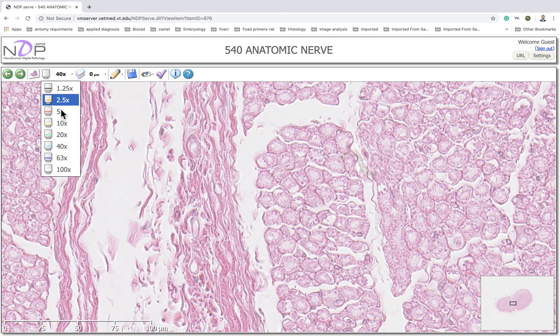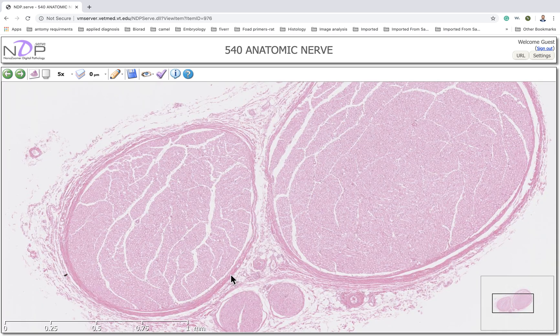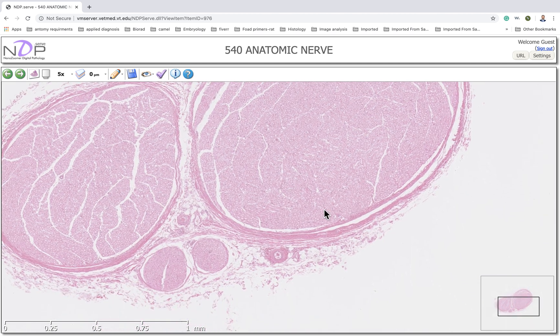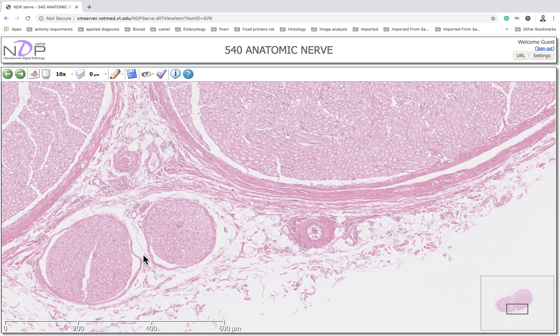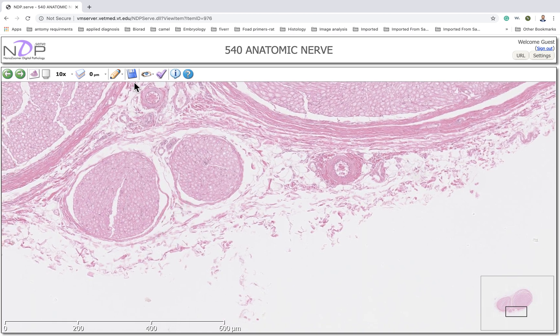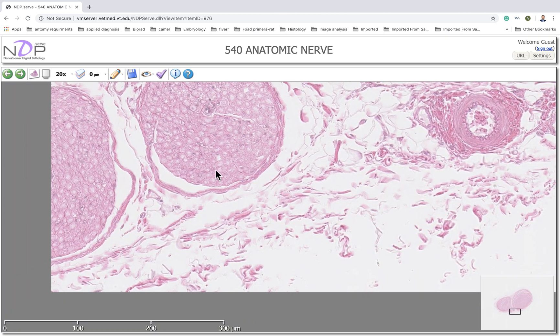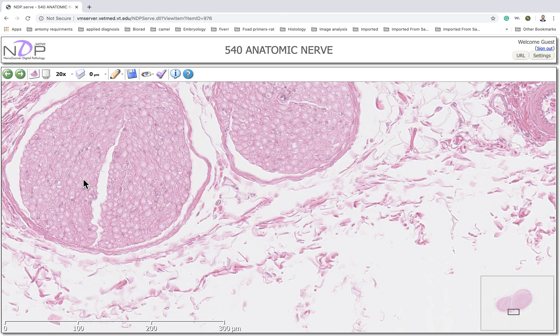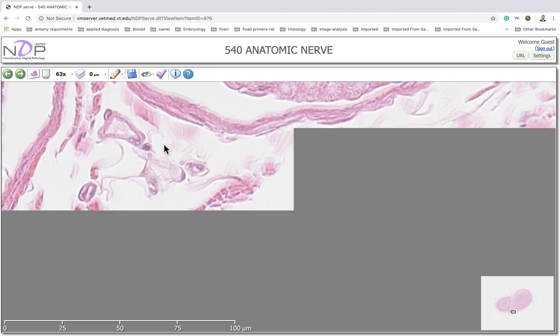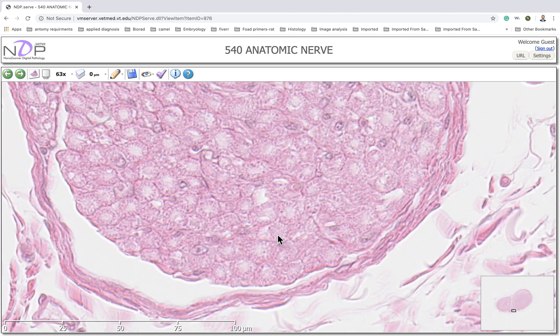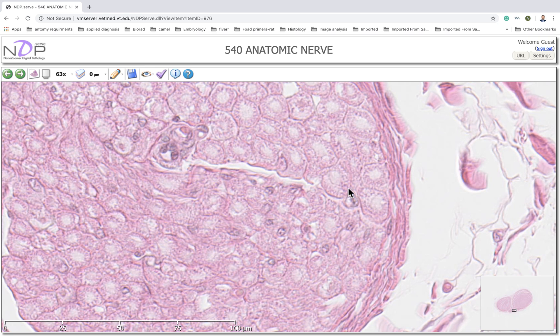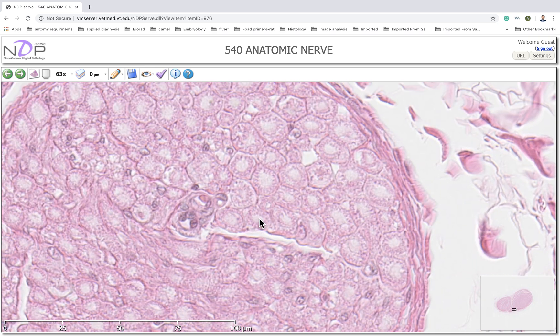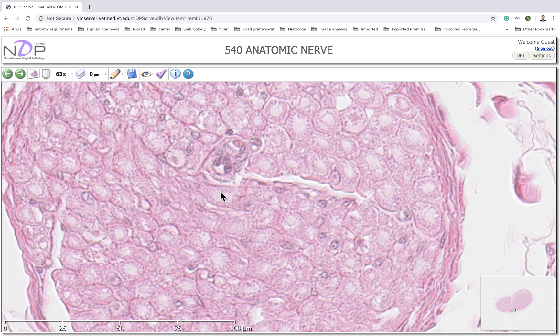Going to higher magnification again, this is the perineurium and this is the perineural space. All of these bundles contain mostly myelinated axons. This area also shows a perineurium with a perineural space. Most of these axons contain the myelin sheath, so most are myelinated axons, and this nerve is called a myelinated nerve.